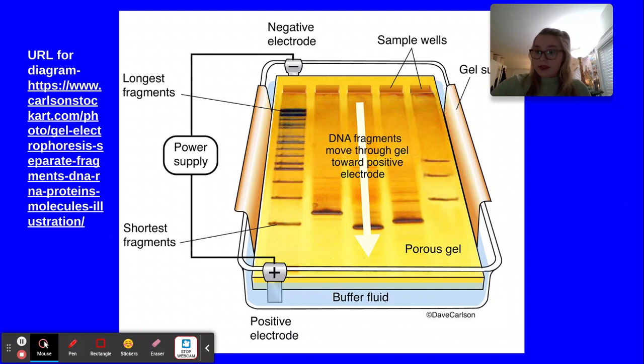To determine the veracity of evidence in an investigation, DNA analysis is used. It makes DNA fingerprints of the crime scene and suspects. For example, in a homicide case, this method could be used to determine if a suspect is innocent or guilty.